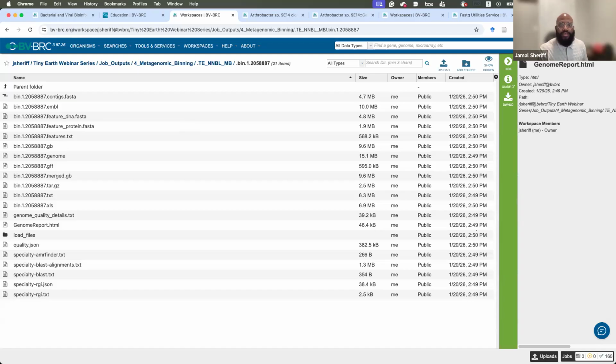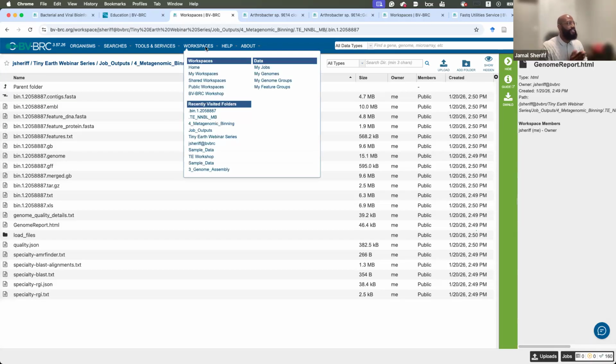All right. As I said, we will go over the genome viewer next week. These next 2 parts are everything that you need for next Friday. We've done quality control. We looked at the diversity of our read file. We know we have good quality reads. We know the abundance of which taxa we have within our file.